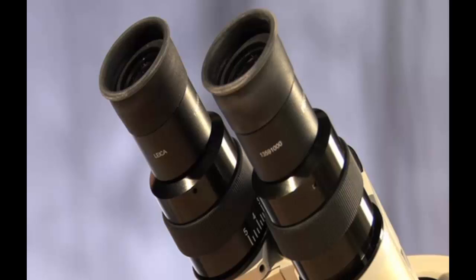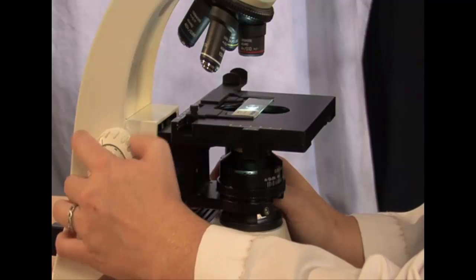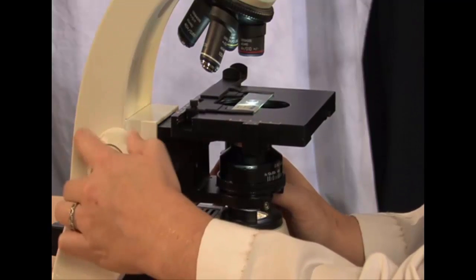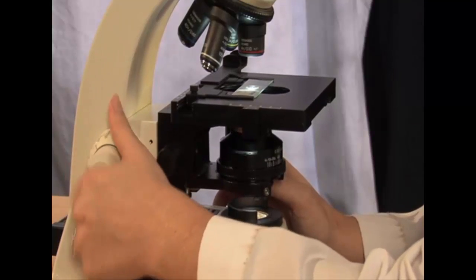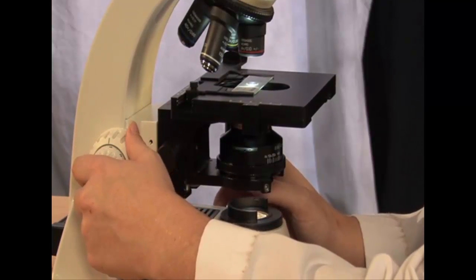Put your eyes to the ocular lenses and turn the coarse adjustment knob to bring the stage to its highest position. Now start to look for the letter E. You may have to turn the coarse adjustment knob to slightly lower the stage. This is okay because you want to bring the letter E into a nice, sharp focus.